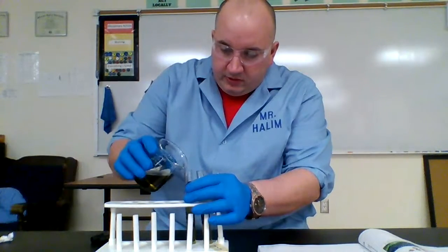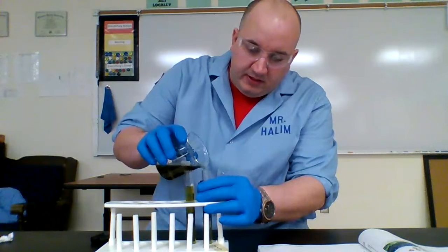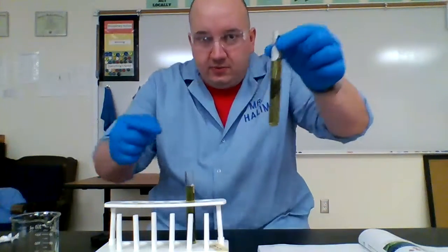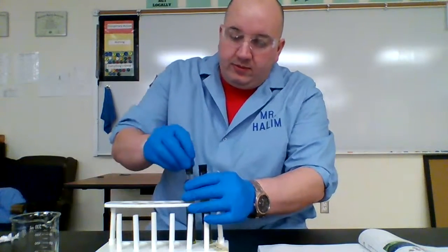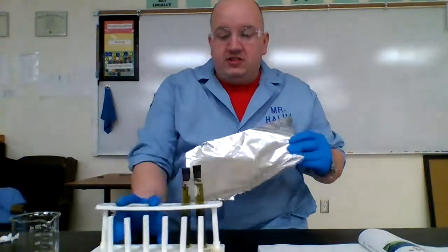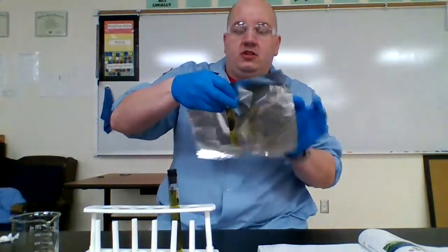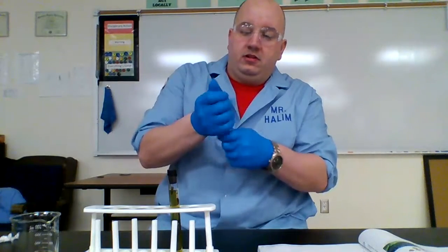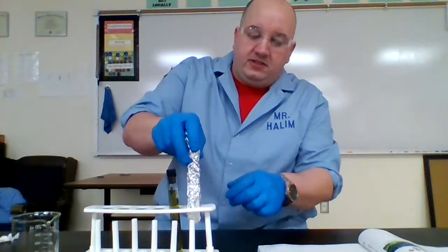At which point then you are going to take your bromethymol blue solution and fill it back up till it is about 3/4 of the way to the top. Make sure your Elodea plant is completely submerged. Then you're going to replace your rubber stoppers so that no oxygen or anything is getting inside. You're going to take a small sheet of foil, then you're going to take one of your test tubes, and you're going to completely wrap it in the foil. This way, absolutely no sunlight can get inside of it.